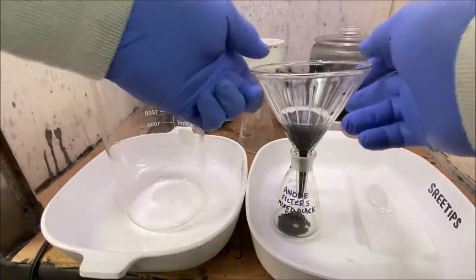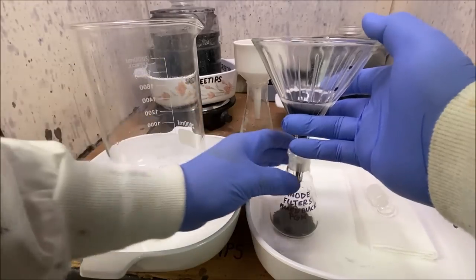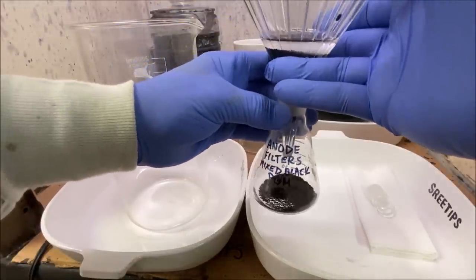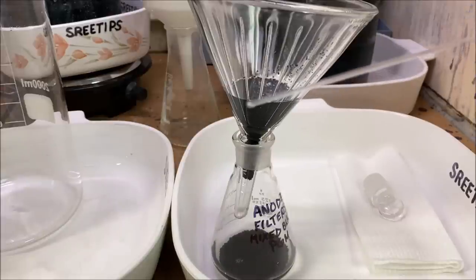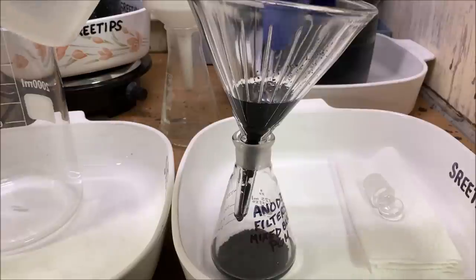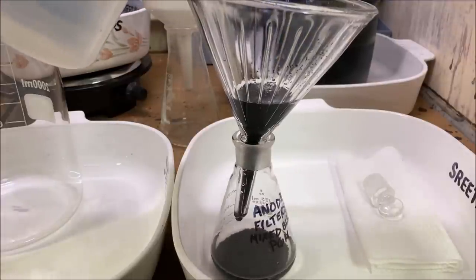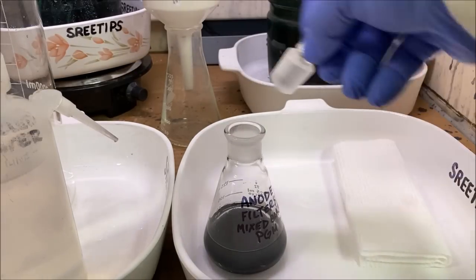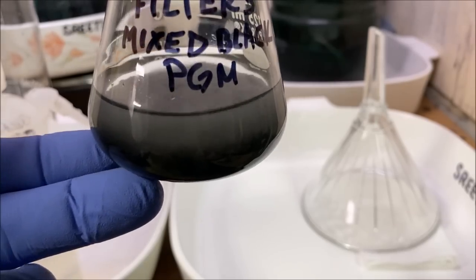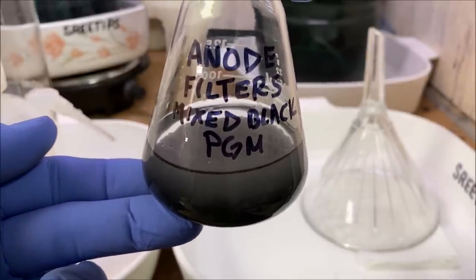Probably when we go to do the stock pot series — the next stock pot that's coming up — what we'll do is add this mixed black PGMs into that series and get a complete refining. I've got a small glass capillary tube here and I'm going to use it to prod the metal down into my container. Here's our mixed black PGM powders that we recovered from the anode filters. We'll set this aside and throw it in with the stock pot refining the next time we do the stock pot.